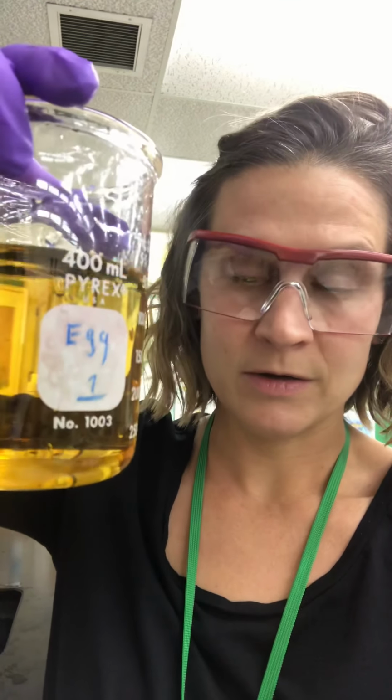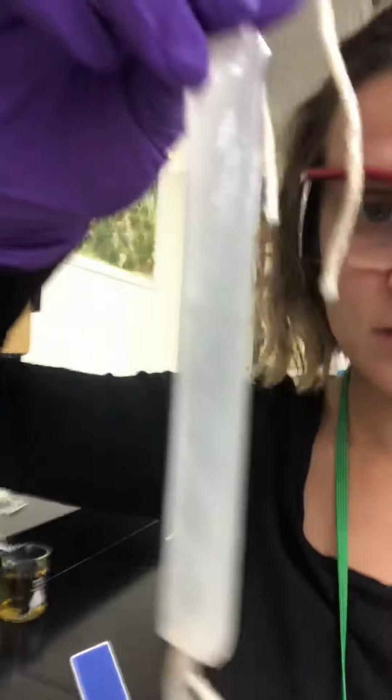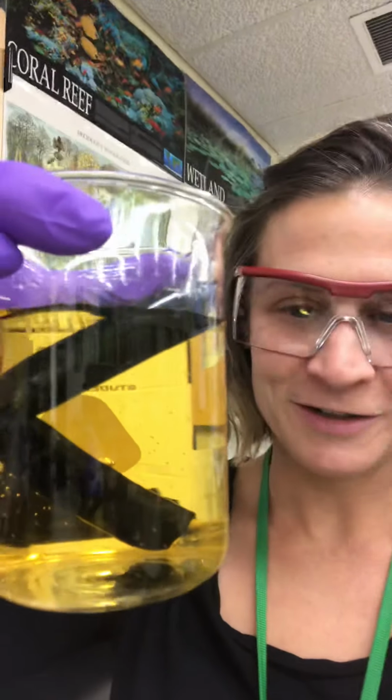When we initially start this experiment, you'll see on your data table you have to fill out some questions. The water in the beaker is yellow or orange, whatever you want to call it, and the water in the bag, the starch water, is kind of white. So I'm going to go ahead and put that in there, and we would make some observations over time. With the magic of science here, let's say time has passed, and this is what we observe.